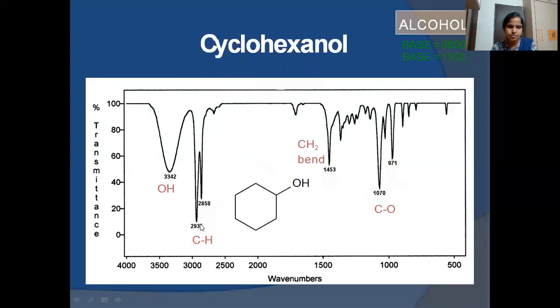So this is again sp3 CH. Then we should also observe which one? This one, carbon oxygen, C single bond O, which we can see here at 1070.